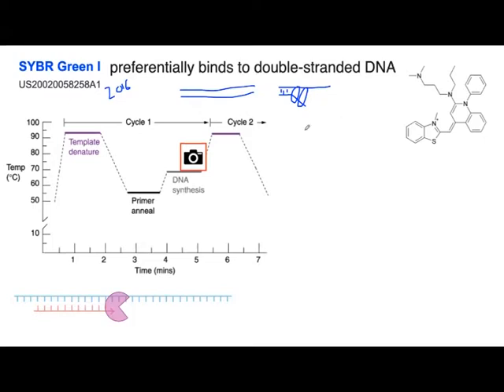So remember that in the PCR, this is my PCR, I'm going to put the two primers, primer number 1 and primer number 2. At the start of the reaction, the fluorescence in this tube will be very low because SYBR Green is there, but it does not fluoresce. It only fluoresces whenever you form a new double strand molecule, it starts to bind to the DNA. So whenever the DNA is being synthesized, it comes and intercalates between the bases. So after each cycle, you get more fluorescence.